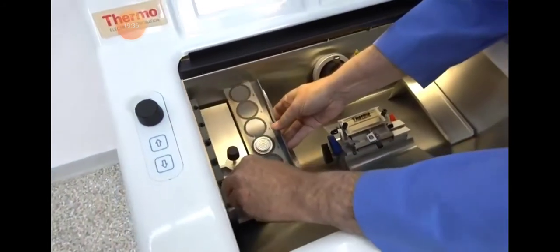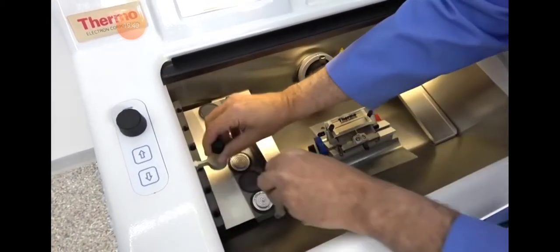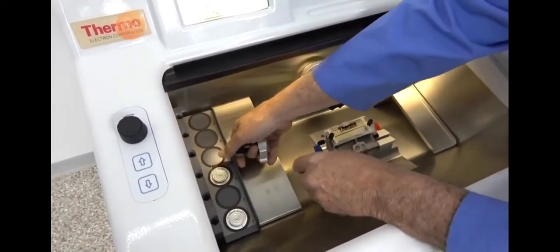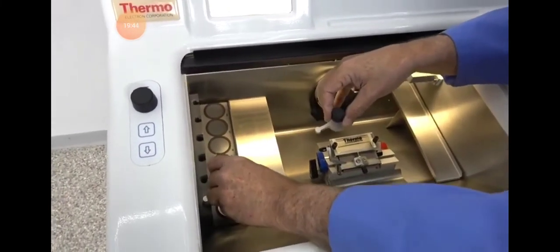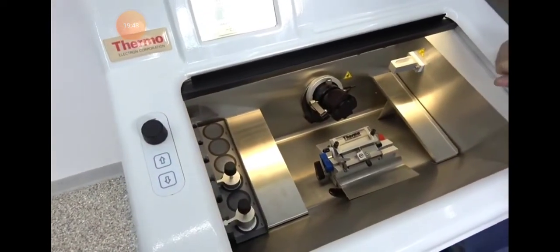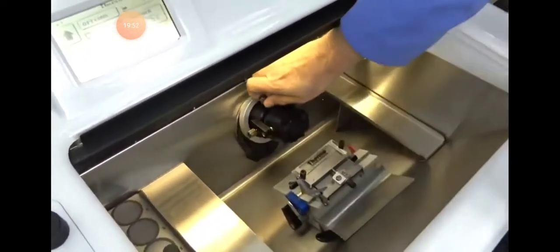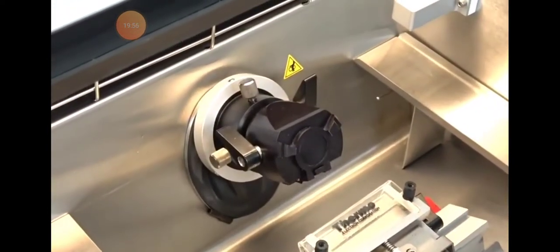specimen heads. Of course, these would typically not be there. Set in, and of course that'll suck the heat out of your specimen head. Fully rotating, articulating head.